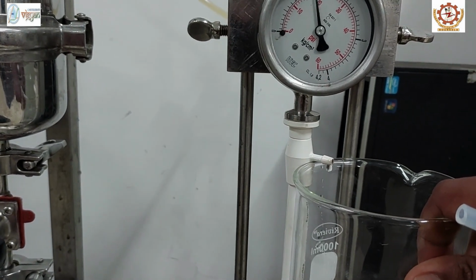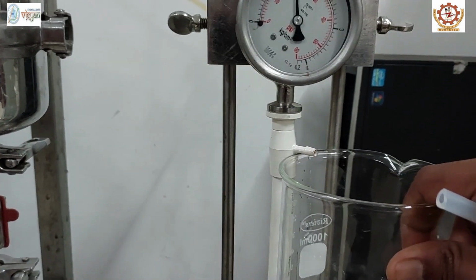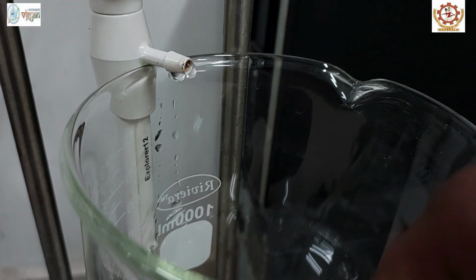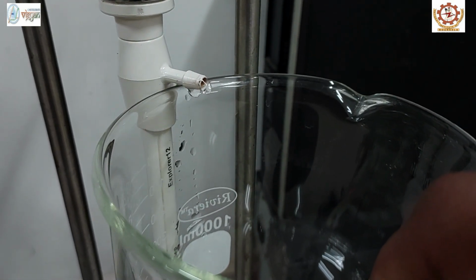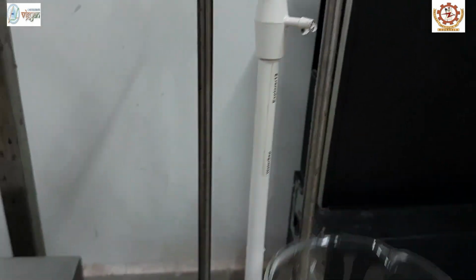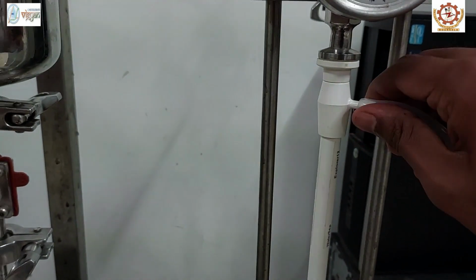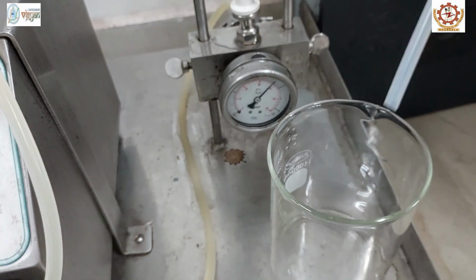This is how the clarified juice is flowing out of the membrane. You can see it is a clear, colorless fluid. We will keep the silicone tube back so that the permeate, or the clarified juice, can be collected in this beaker.